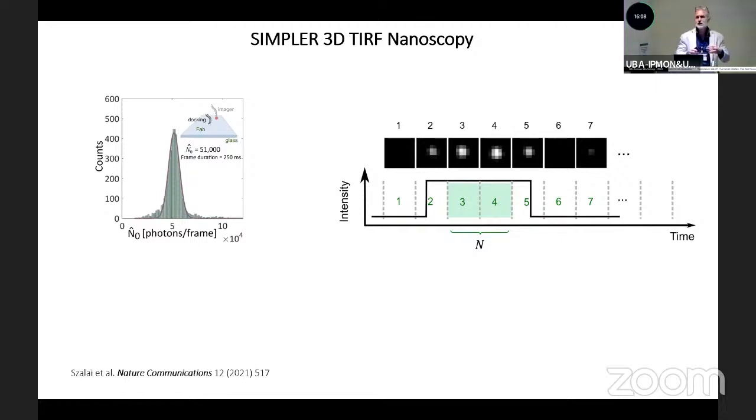And then you perform a STORM measurement or a DNA paint measurement, any single molecule localization measurement where you let molecules blink, and you know that you can determine the center of this, and you can tell the XY position. But on top of that, we take the intensity of that. And the intensity will give us the axial position. So basically, we take XY from a fit to this, and we compute the number of photons divided by the N0 that we determined here. It directly gives us the axial position, okay?